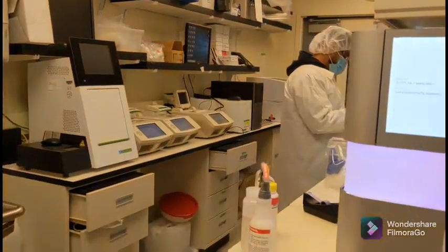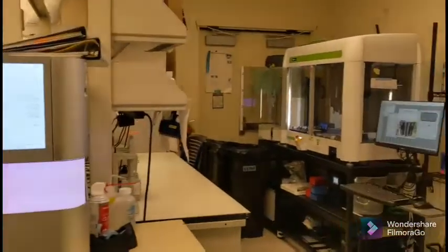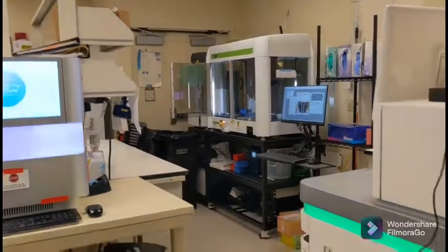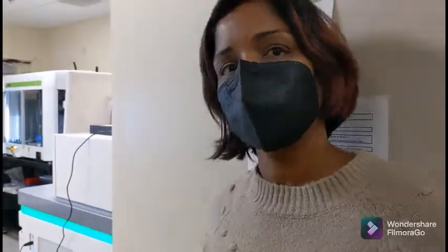So we use liquid handlers, which are these robotic instruments, which is our green and white one on the right corner, and that allows us to do a large number of samples at once. Okay, so can you tell me again what that machine over there in the corner does? So that is one of our liquid handlers. It's a robot, basically, that allows us to automate some of the steps of the operation so that we can process more samples at once. Does that also, because it's robotic, minimize the risk of contamination of the samples? And it minimizes a lot of the variability that comes from human handling.